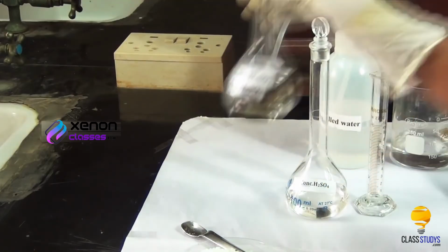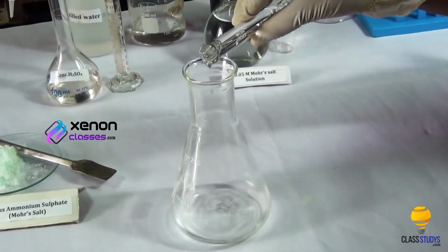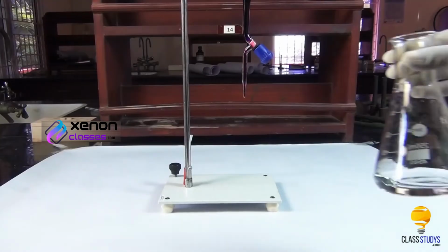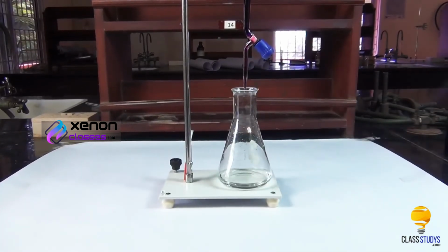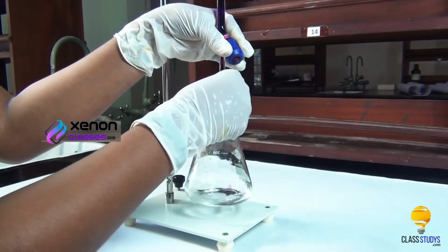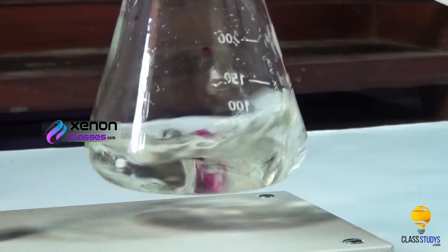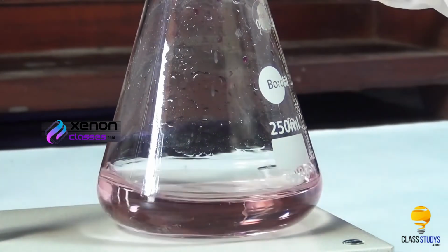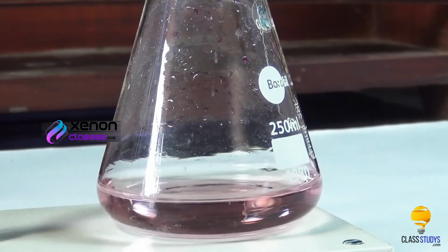Now add about 20 ml, which is a test tube full of dilute sulfuric acid, to the Mohr salt solution in the conical flask. Place the conical flask on the white surface of the stand under the burette. Titrate the solution in the conical flask against the potassium permanganate solution from the burette. Keep rotating the conical flask during the titration and stop the titration when the solution turns to a light pink color. This is the end point.